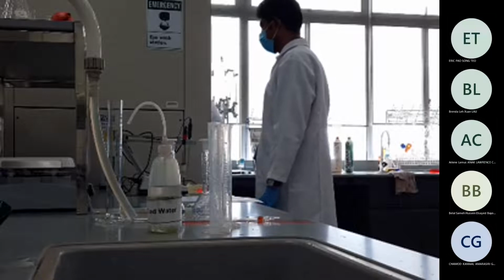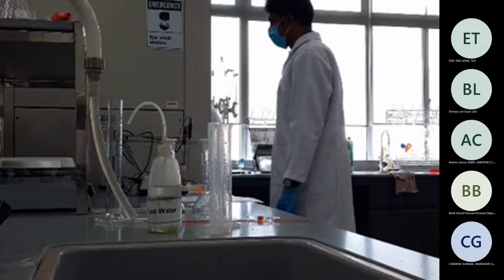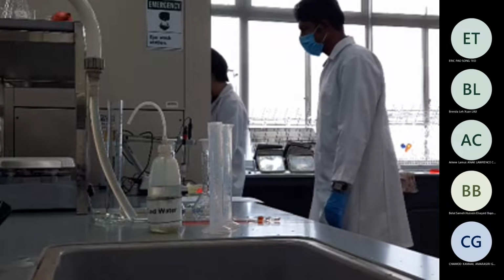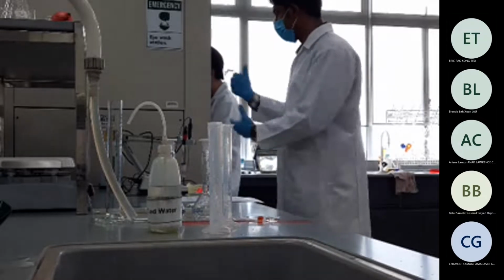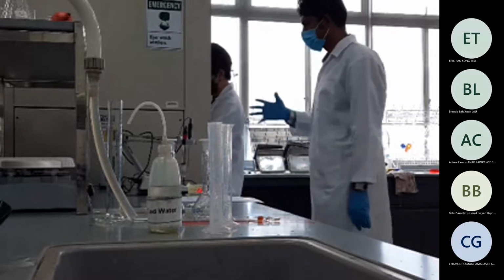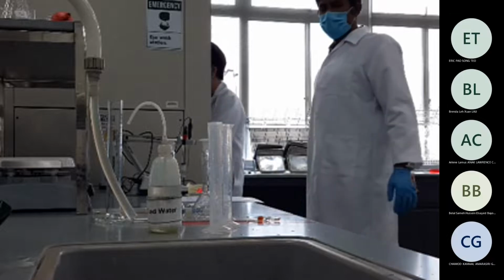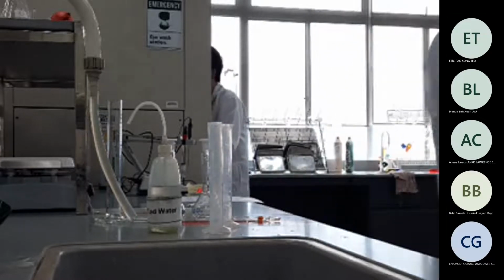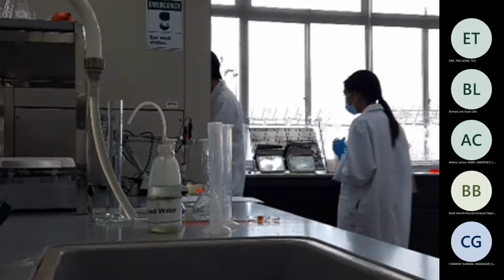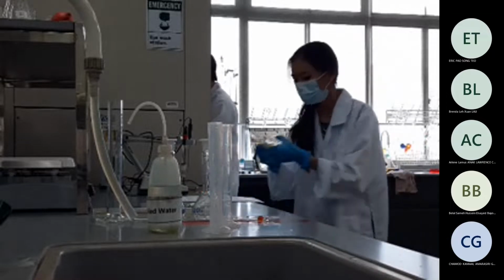Yeah, enough. I thought measuring using this is less accurate. Yeah, but afterwards you have to take with the pipette to the volumetric flask. So just take maybe 15 to 20 milliliter. Have you labeled it? No? Okay, otherwise you will confuse it.